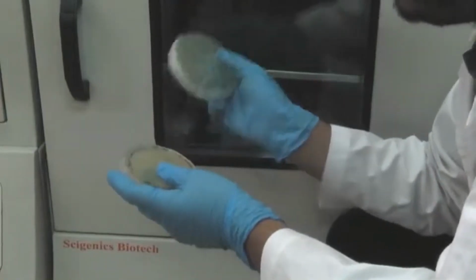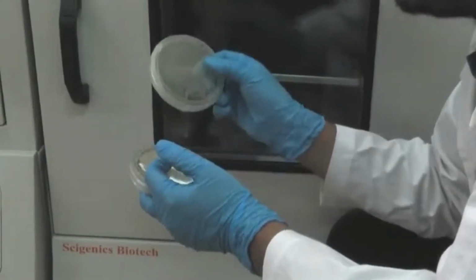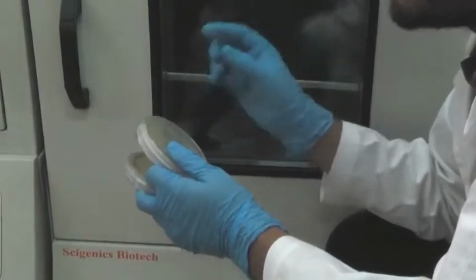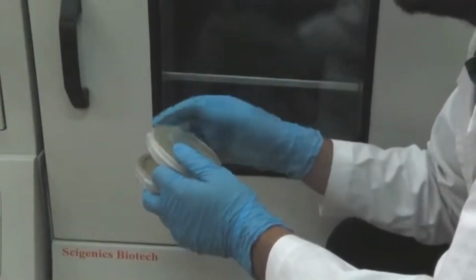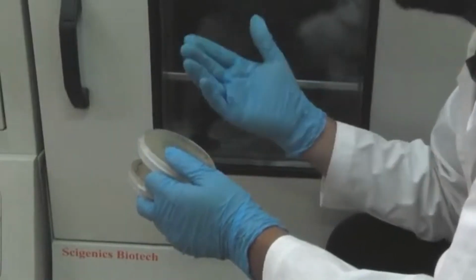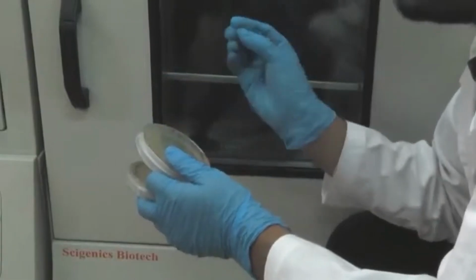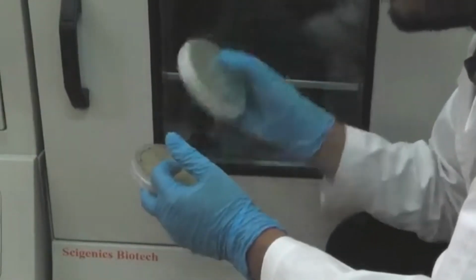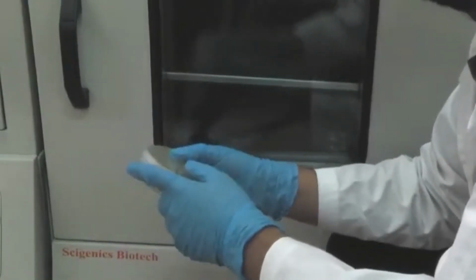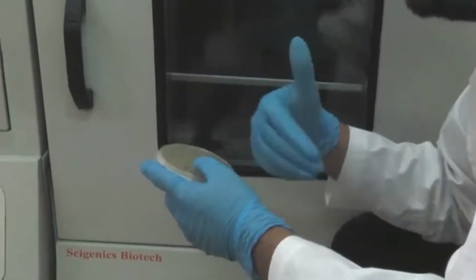So, you plate in the evening, you leave the lab. In the morning, first thing that you do is you check if there are any colonies. In case there are colonies and they have grown to sufficient size and there is sufficient number, by sufficient, what I mean is you will learn that through experience. When the colonies are round and well apart and not too small, not too large, you should take out the plates, seal them with paraffin and store them in 4 degrees centigrade to prevent further continuation of growth, which might lead to a lawn formation.